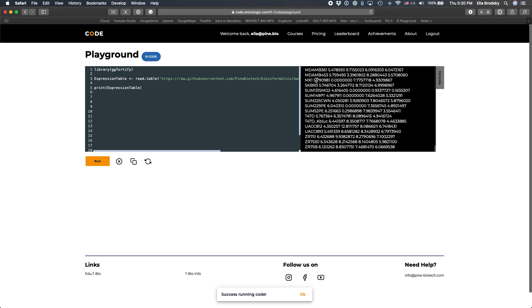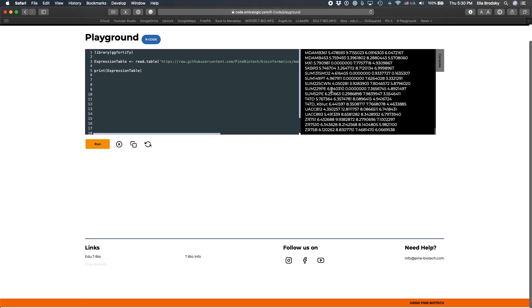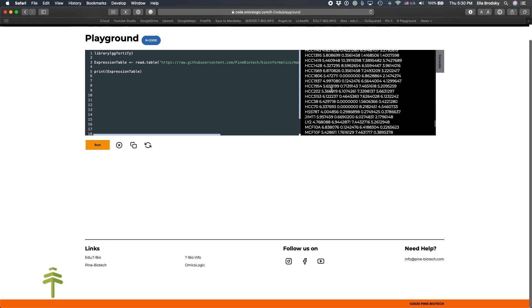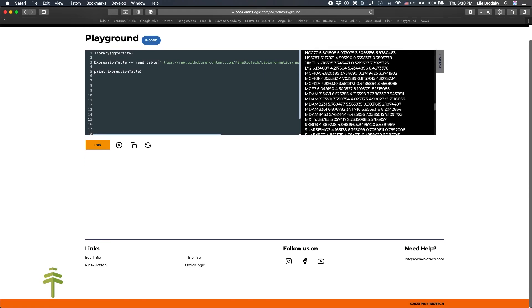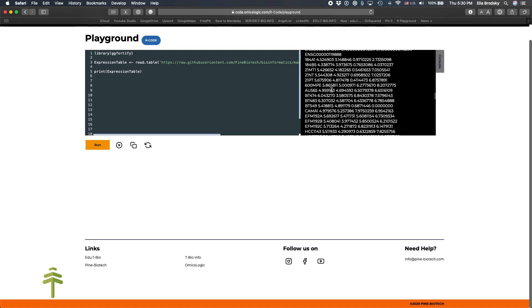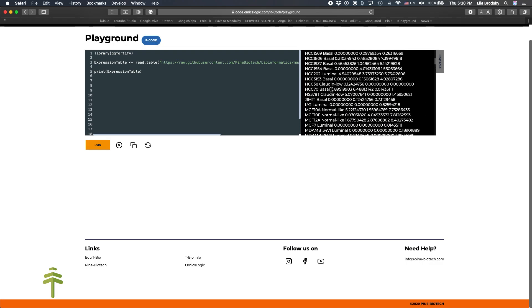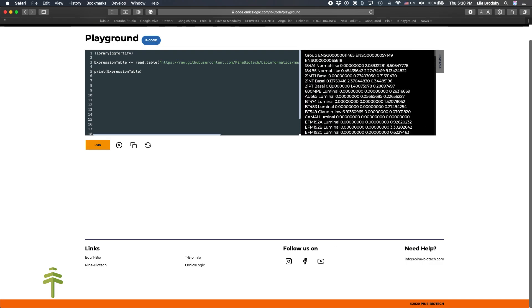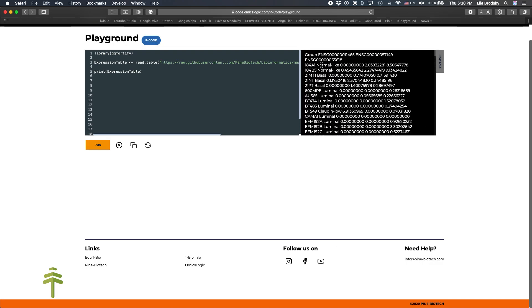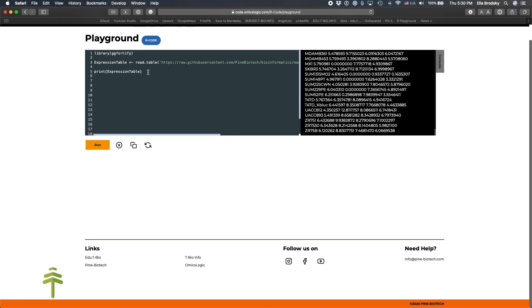So as you can see, we have here the name of our sample. And we also have a group name. You can see here that you've got some group names and you've got the sample names. And that's the group.